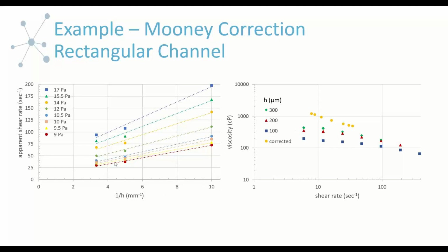Now, one of the things when you're doing this, oftentimes you're going to have to interpolate to get all of these data points at a fixed stress value. Ahead of time, I don't think our data was best suited for this, and my interpolation may not have been the best. So you want to get as many points as you can if you're trying to do this process, so that your interpolation is better than mine was. That's just a tip that I would recommend.